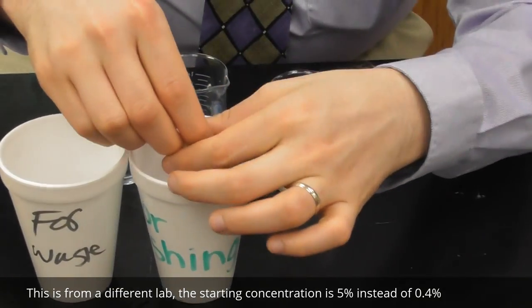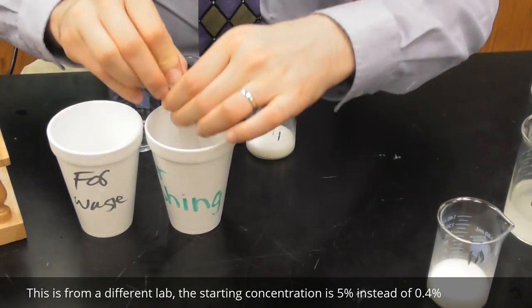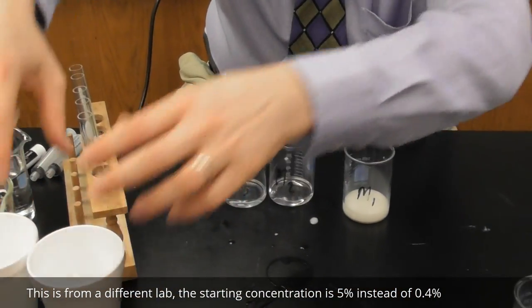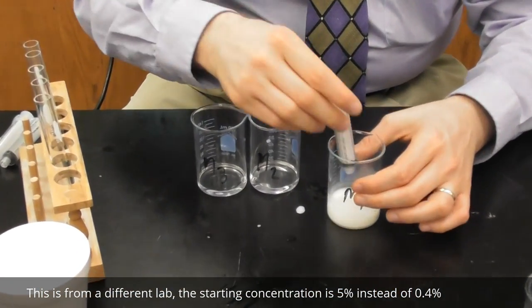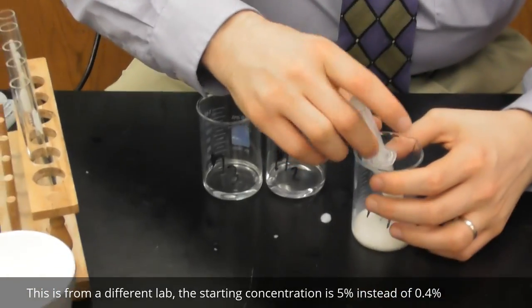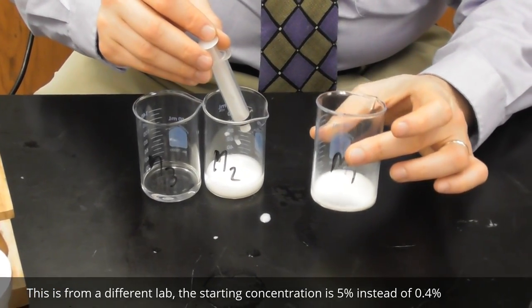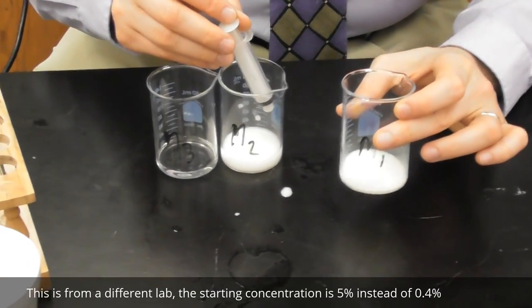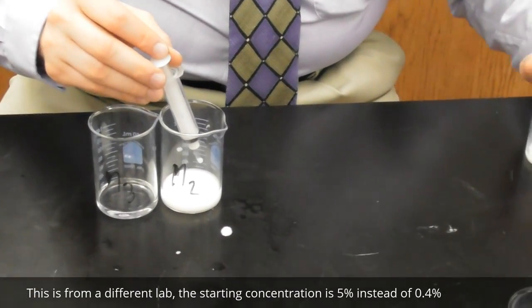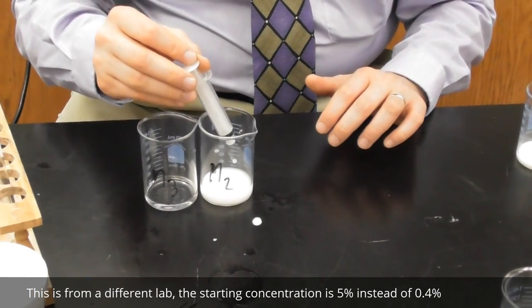And now I need to clean my syringe. Washing, waste. Washing, waste. Washing, waste. Clean that off. Set those aside. Now, I need 10 cubic centimeters of this, and I'm going to put that into M2. This is now 10 cubic centimeters remaining of my 2.5% M1. Set that aside so I don't mess with it. The last thing I want to do is mess with the things that are done. So I'm setting them aside so I don't screw them up.